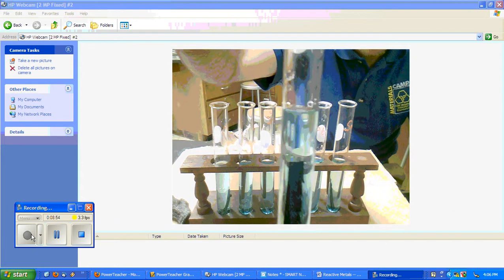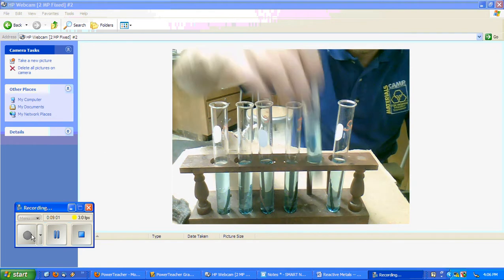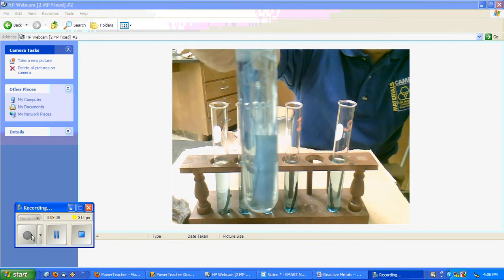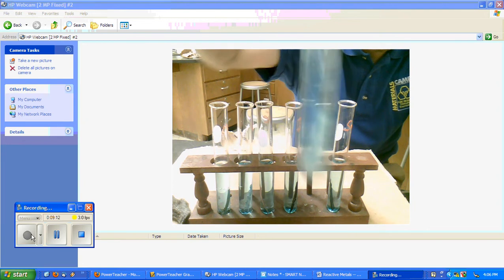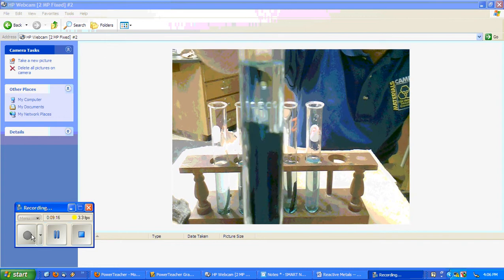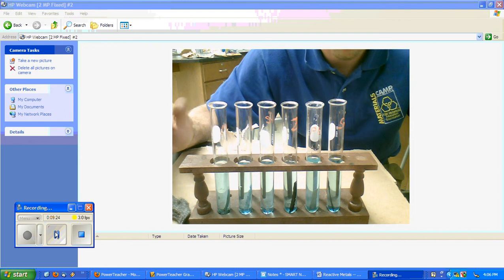Zinc. Lead. And tin. Alright, so pause it here, give it about 5 minutes, then we'll check back on.